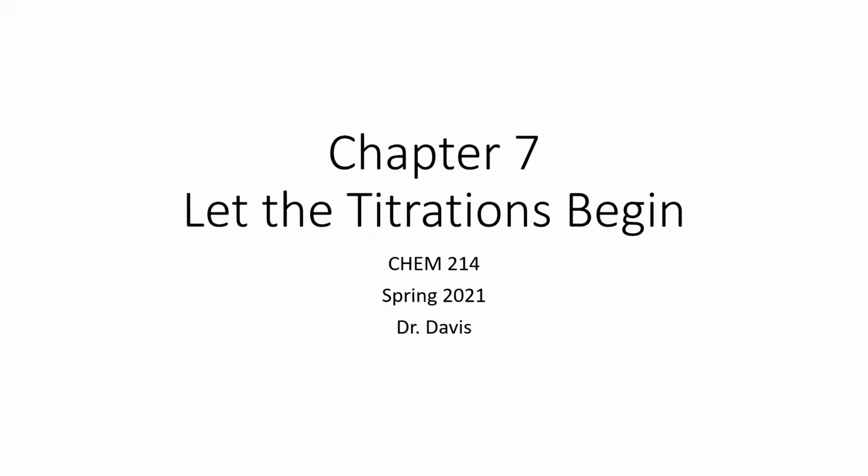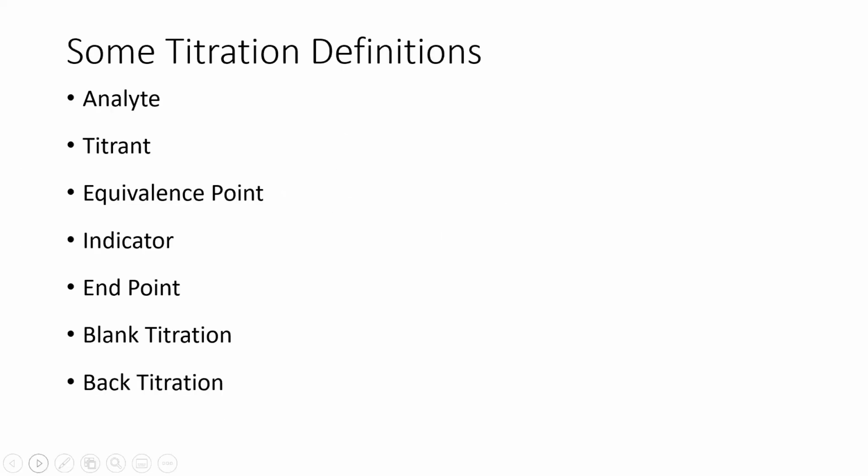We all know what we're talking about. So, some titration definitions.